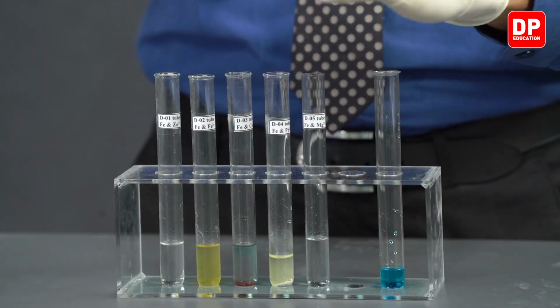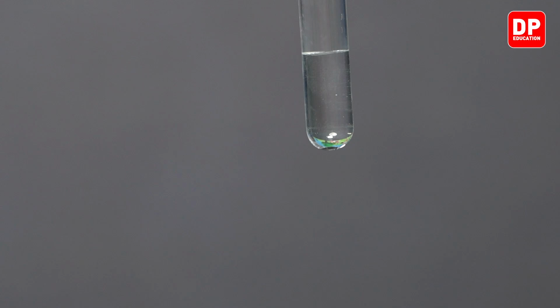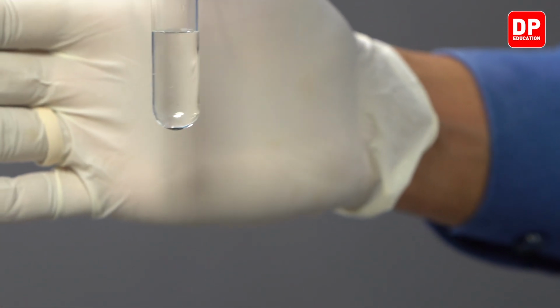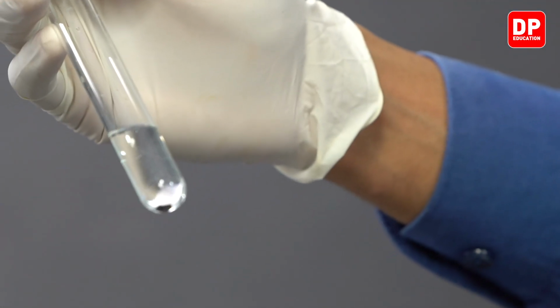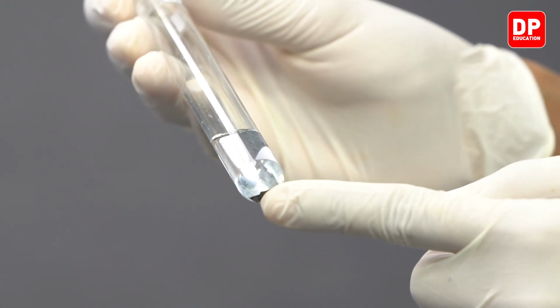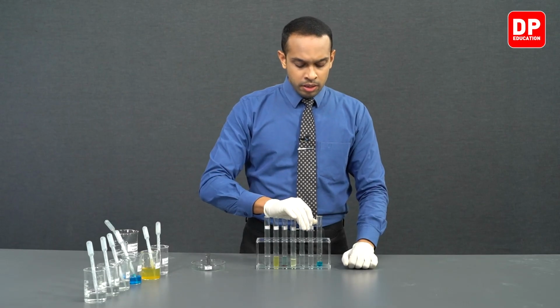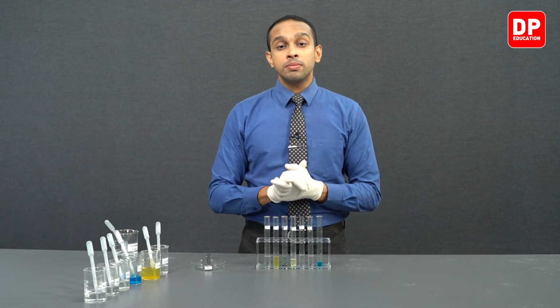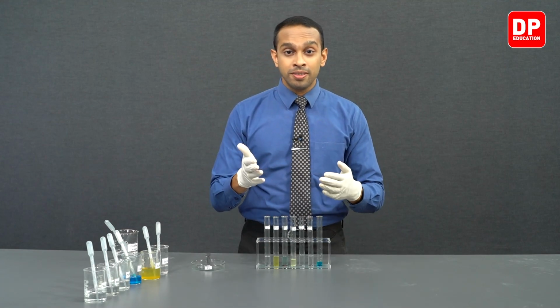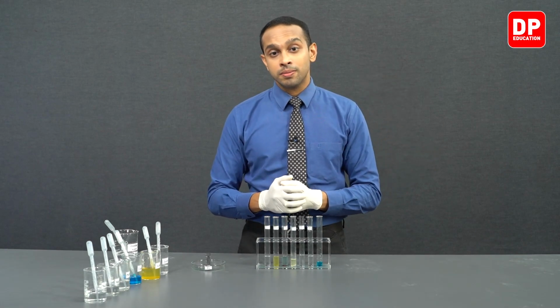And finally, sodium 1 plus aqueous ion solution and metal reaction, you can very clearly observe that there has not been any reaction, no color change here, right? So students, that would indicate that between sodium aqueous ion solutions and iron metal, there is no reaction. This would indicate that sodium is found above iron in the reactivity series, or sodium is more reactive than iron.